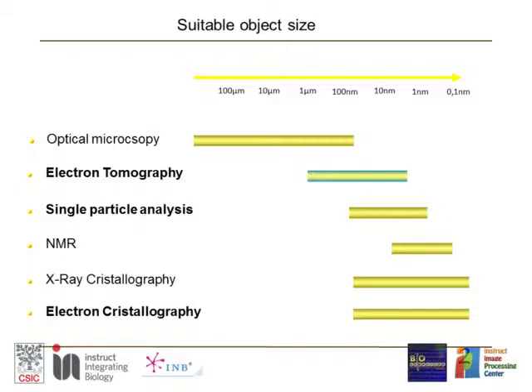So the typical scale for single particle analysis is on the order of 200, 300, 400 Angstrom for a big specimen, down to 20, 30 Angstrom for a small specimen. So this is the typical range in which we are going to move. Typically a few hundred Angstrom specimens. The largest specimens are things like the ribosome, things like that.